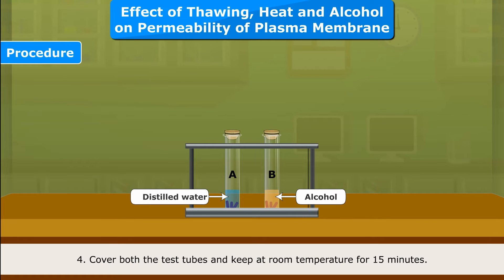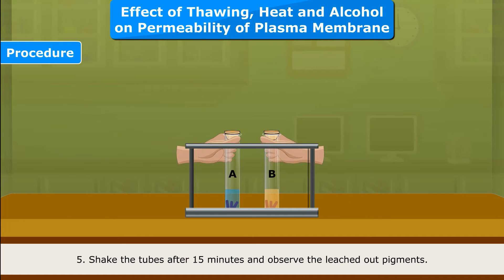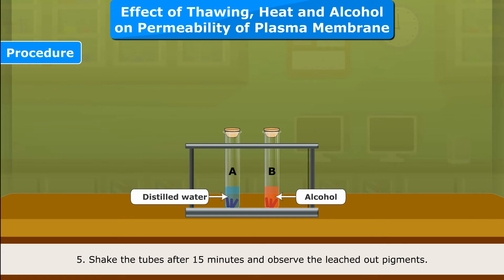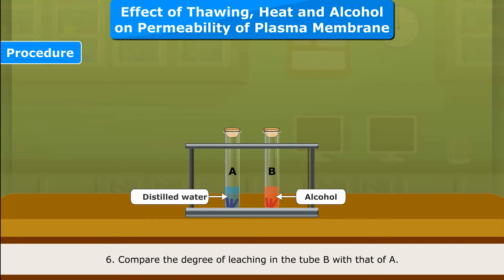Cover both the test tubes and keep at room temperature for 15 minutes. Shake the tubes after 15 minutes and observe the leached-out pigments. Compare the degree of leaching in tube B with that of tube A.